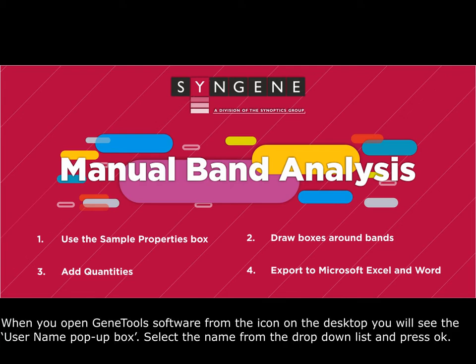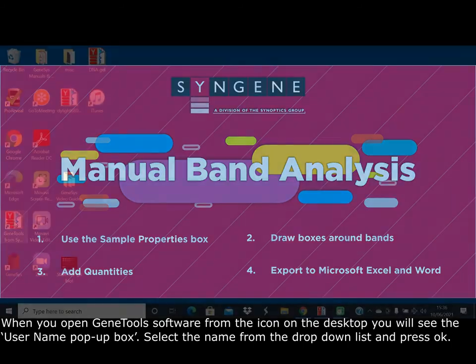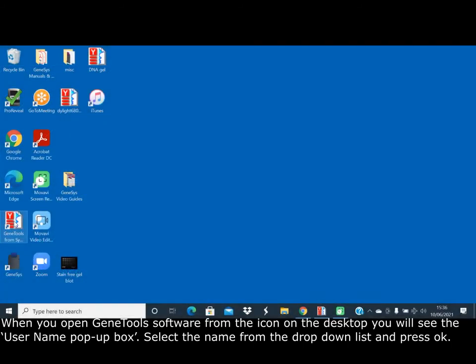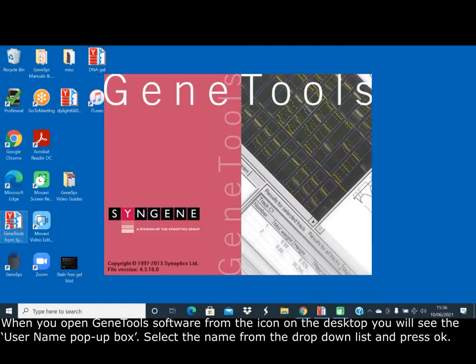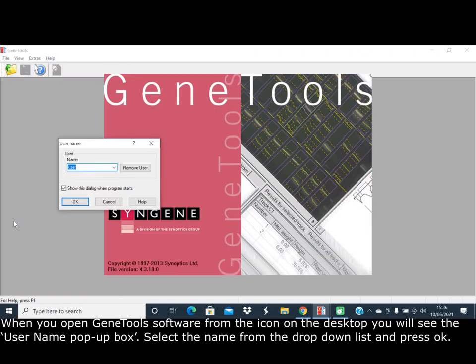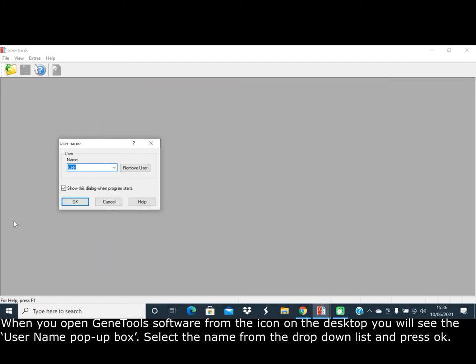When you open GeneTools software from the icon on the desktop, you will see the user name pop-up box. Select the name from the drop-down list and press OK.